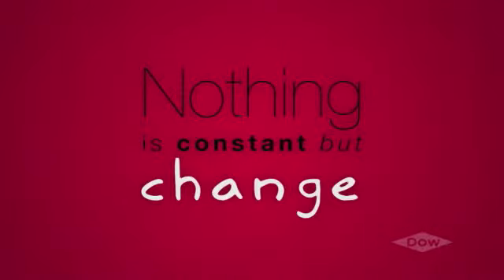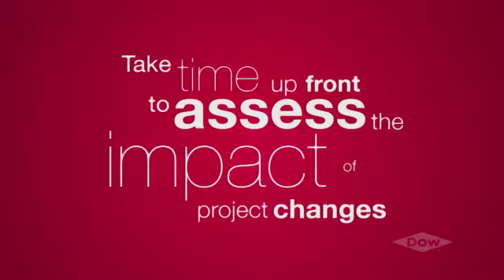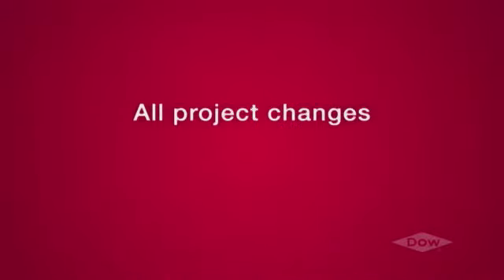We know that change is part of life in the lab. So how do we plan for it? By taking time up front to carefully assess the impact every change will have on safety and environmental issues. All project changes that you make in the lab should be first evaluated for potential hazards.